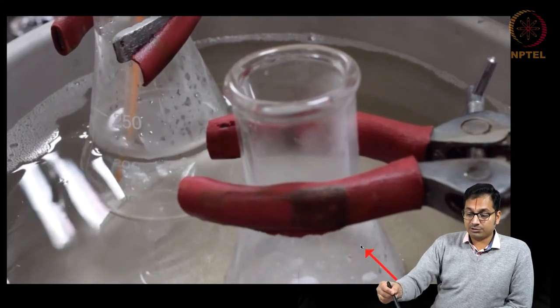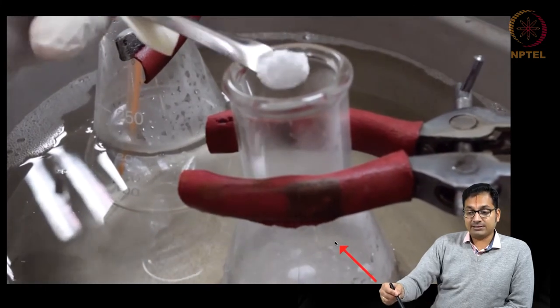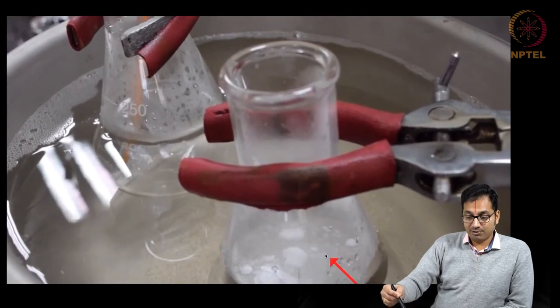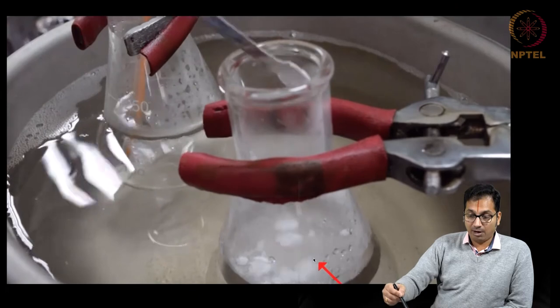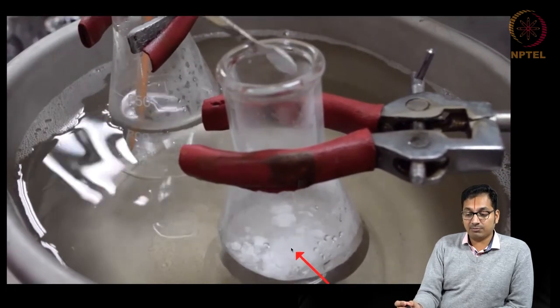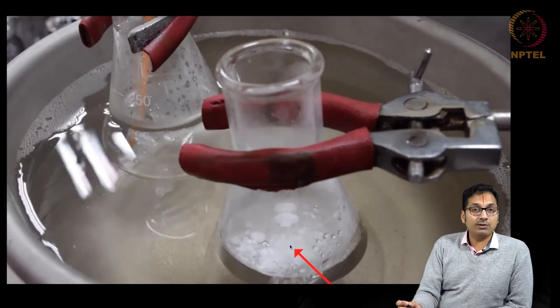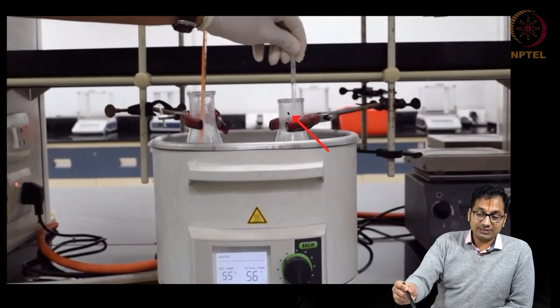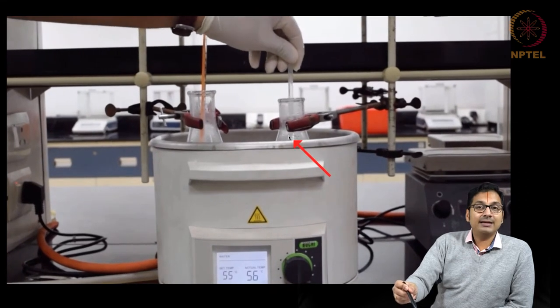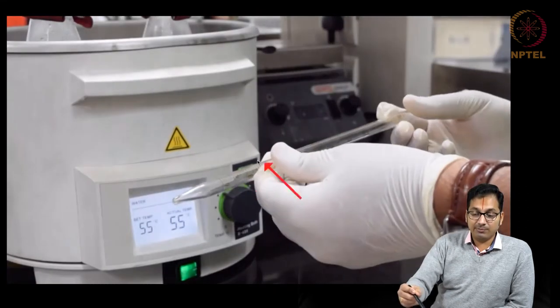And to the clean water conical flask, add excess of benzoic acid as shown here, and once you have added, the next step, you are able to realize the solid is all at the bottom of this conical flask. So this also results in the trouble that the benzoic acid is not going to be properly dissolved. So therefore, use a glass rod and stir as much as possible in order to make sure the interaction between the solute A and solvent B is done.